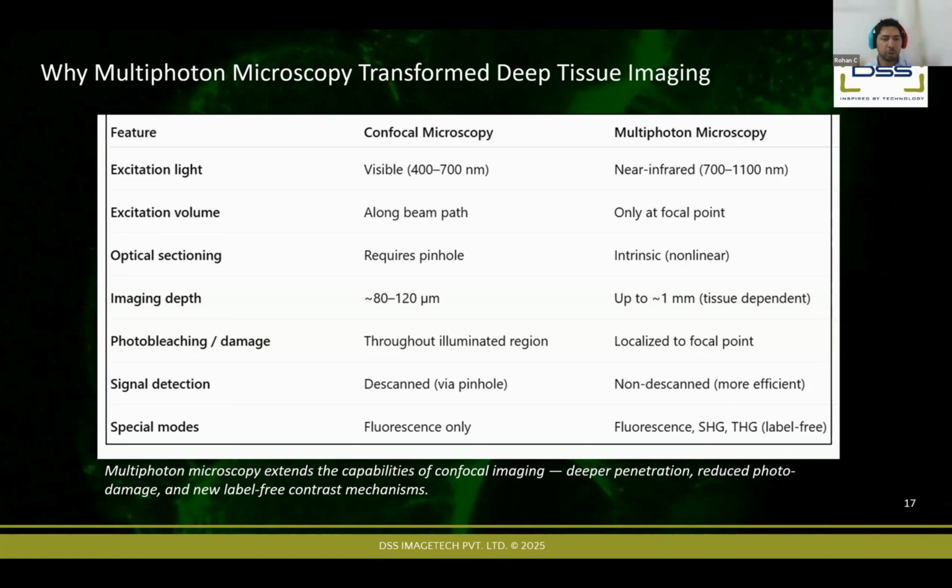That kind of resolution you can get with a multiphoton or a confocal microscope, which you'll not be able to achieve with color microscopy with hematoxylin labeling, for example.